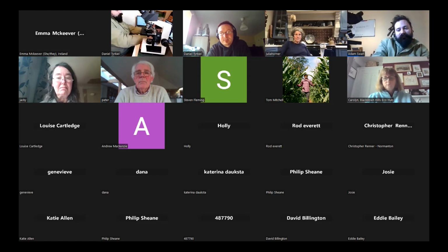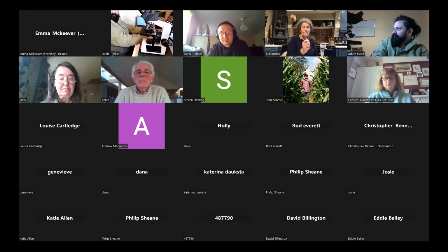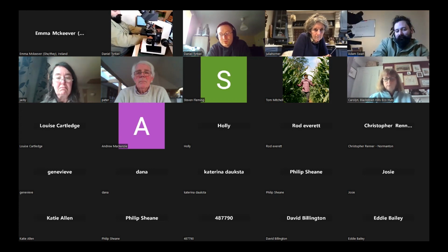Yeah, I was just wondering, I got a bit of funding. I'm currently trying to set up an Oxford Nanopore experiment to do soil metagenomics. So I'm currently going through teaching myself how to try and set that up. I was wondering, for yourselves, are you looking into that sort of thing for the Oxford Nanopore?